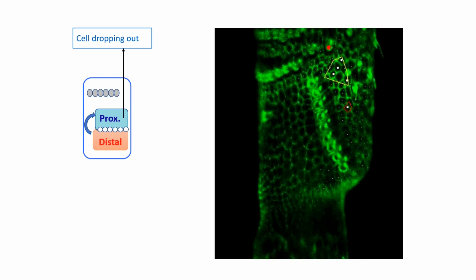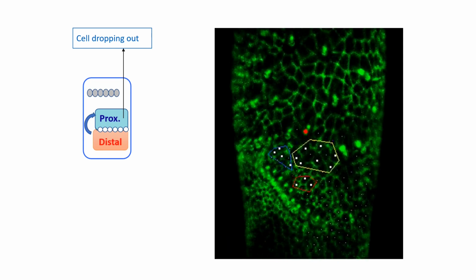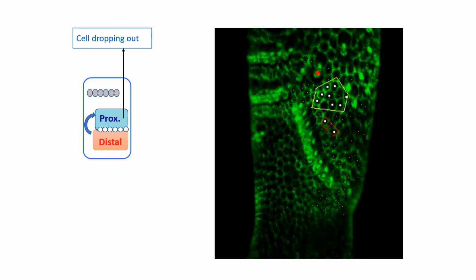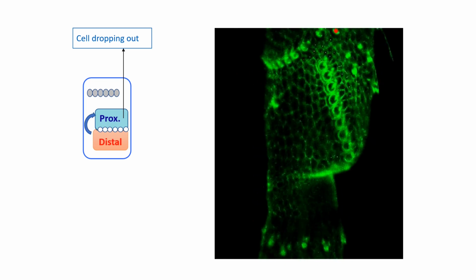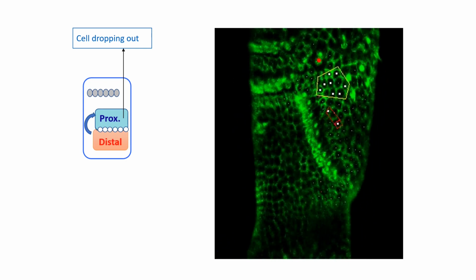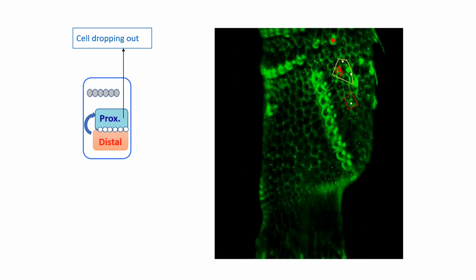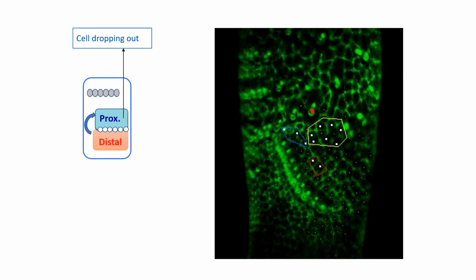So as you can see, as the sex comb rotates, those different cells are dying, and you can see numbers because we tried to count how many of those cells died and in which slide they die to know if we can find a pattern. Maybe you can think, what type of patterns do you think that they will describe? What will be the dynamics?